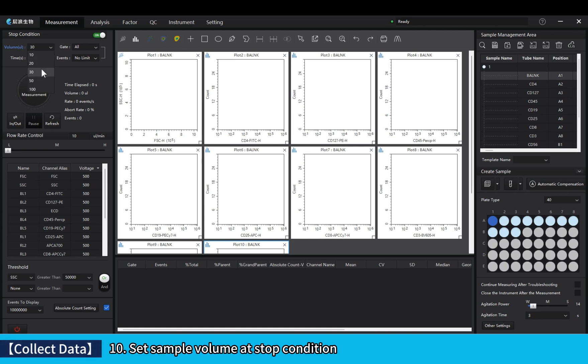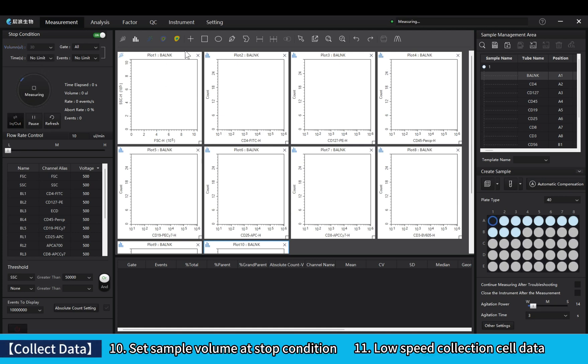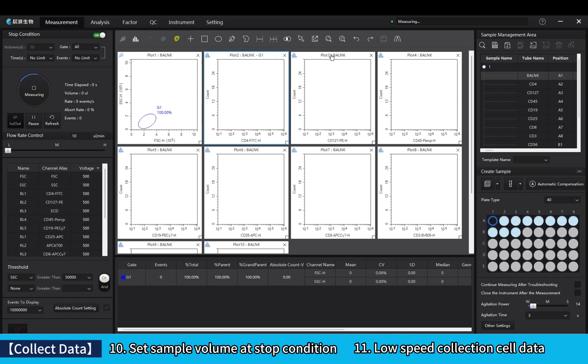Set sample volume at stop condition. Low speed collection cell data.